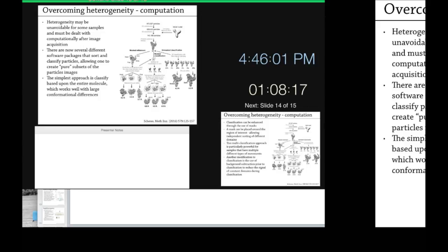Anything that's low abundance, and some particles have very preferred views, so you're only going to get a top view and maybe one other view, and that can be fine. Other proteins have essentially a totally random set of views, and sometimes only a small fraction have one particular view, and by 2D classification, because you're sampling over a fairly wide range of views and forcing them together, you can end up throwing those particles away, even if they're great particles. The same goes for 3D classification: you want to see how much you're throwing away. If you're throwing away 10%, then most likely that's going to be junk, but maybe not.